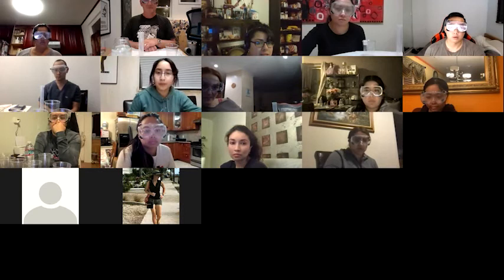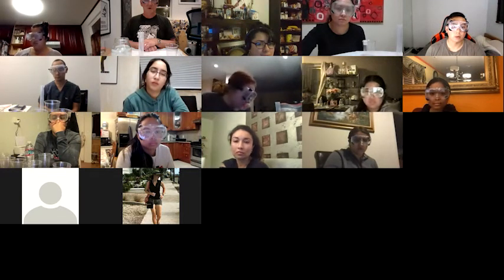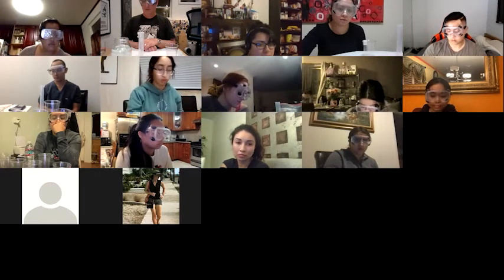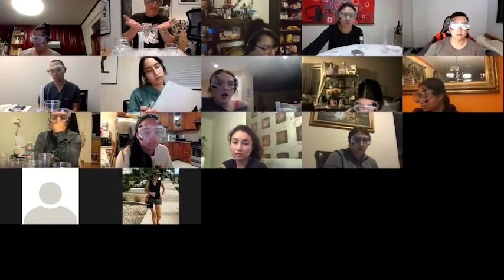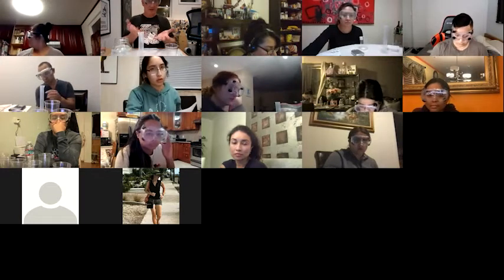Around 20-ish milliliters or more. Nope. What's the density of water? 50 mL, right. At room temperature, the density of water is precisely 1 gram per mL.